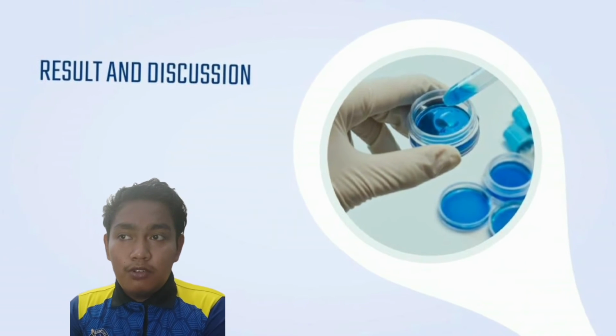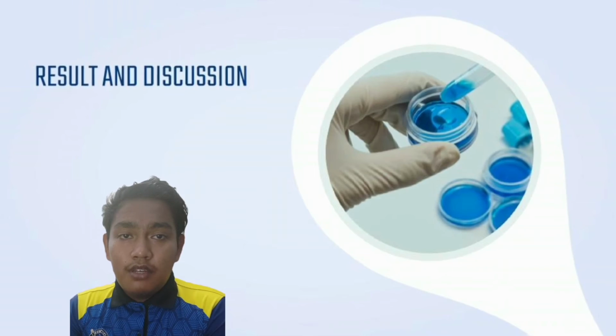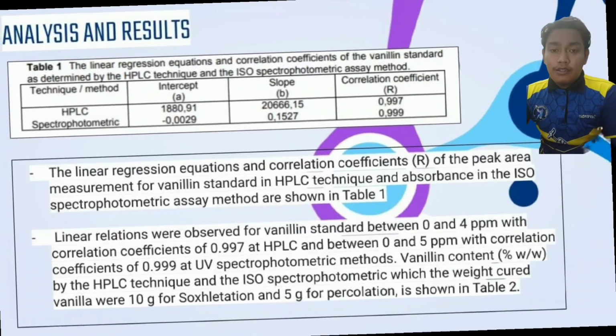Today I'm going to continue this presentation with the results and discussions about the determination of vanillin in vanilla essential oil by high performance liquid chromatography. Now we move to the results and discussions.